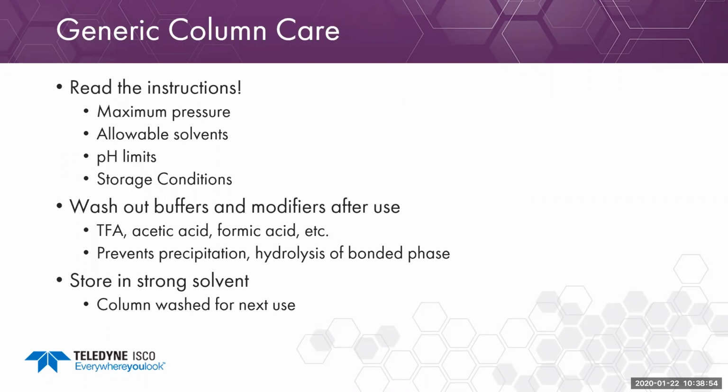So normally you're going to store this in a strong solvent. We don't want any bacteria or biologics growing in the column if you have a high aqueous content. So normally you want to be at least 50% organic modifier to store it in, or whatever is suggested by your column.